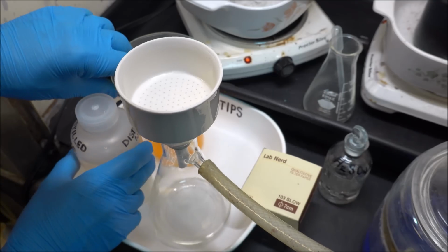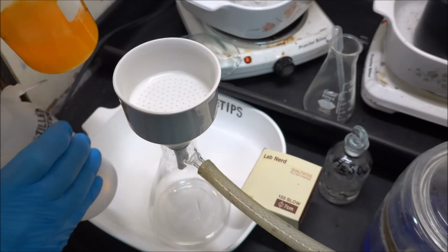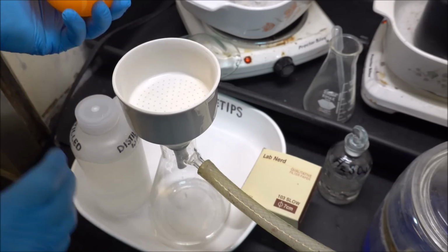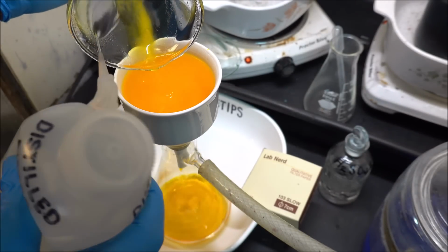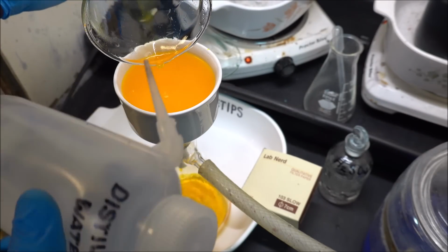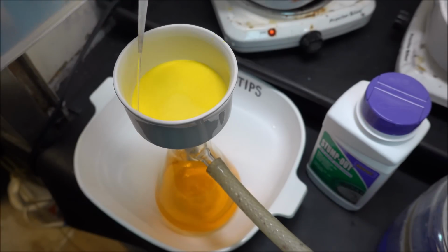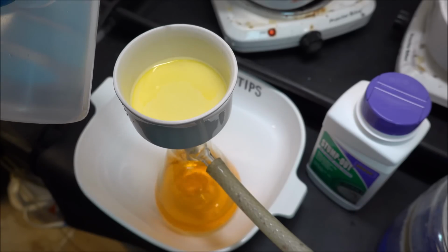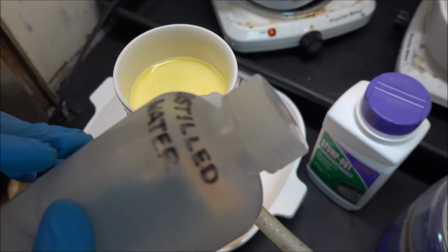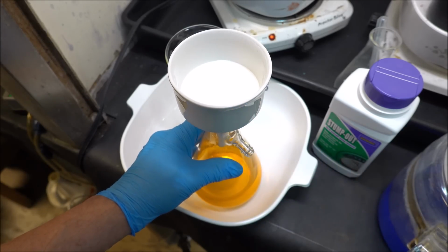Got the solution cooled off. Going to pull it through this filter. And then we'll precipitate it one more time. We're going to rinse all the color out of the filter there. All right, the filter is snow white, nothing in there.